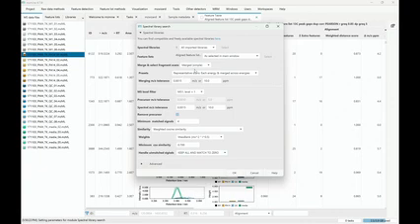But then, of course, there's different scores, like the weighted cosine similarity, and we still just need to add the different scores in here, and then also make a decision, because it's then analog matches. It's not an identity match, so we have to display that in a different way so that you directly recognize: this is an identity, this is an analog. But yeah, that's going to be coming soon. Cool.